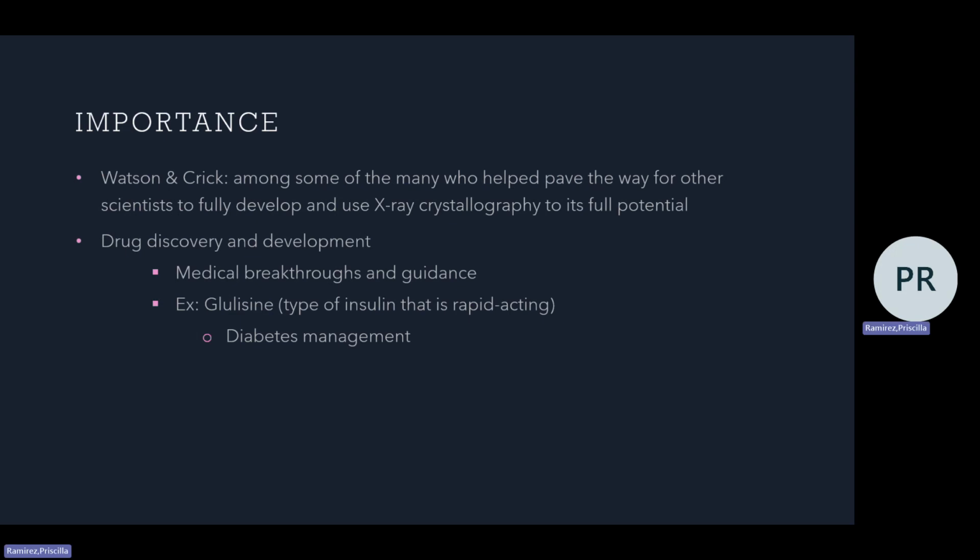So this method of X-ray crystallography is something that I believe is beneficial and a good method to help scientists see the structure of their biological molecule.